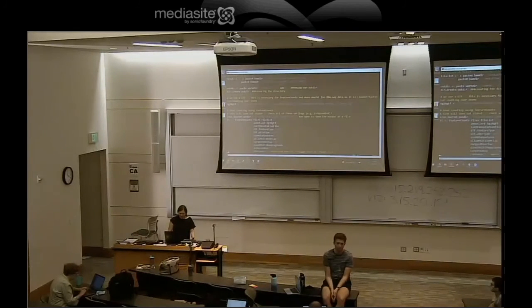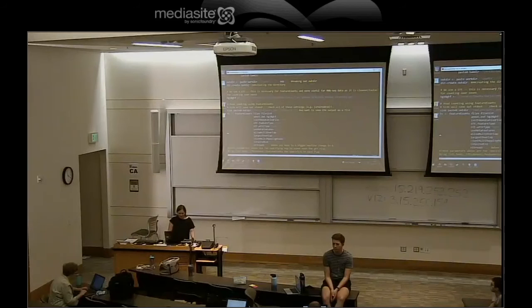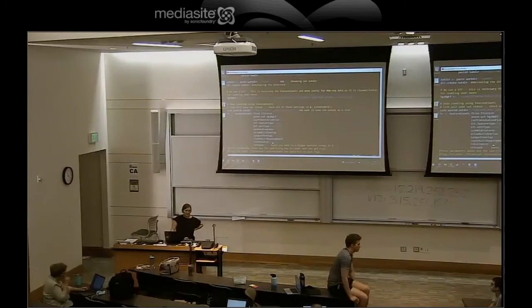And then this is what I was trying to hurry up to. Here's your actual featureCounts command. There's a lot in here, but most of this is just general flags from featureCounts that are telling it things like: here are my BAMs, the annotation, here are my genes, count over my exons. One of the most important ones here that you will probably have to change for whatever project you're working on is if it's a paired end or a single end project. So this is based on your library itself.